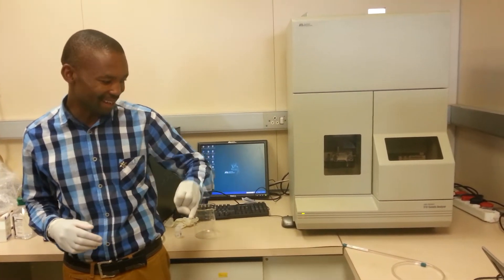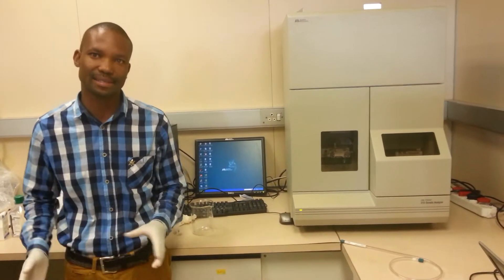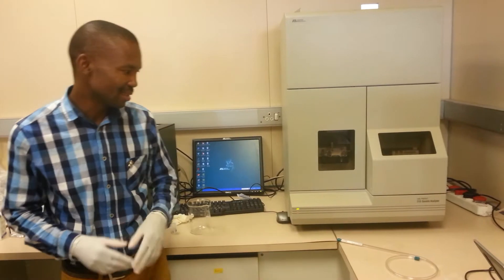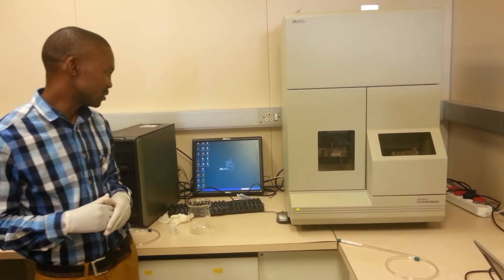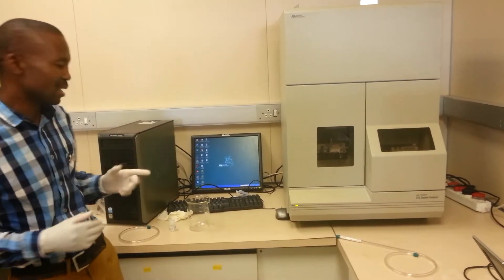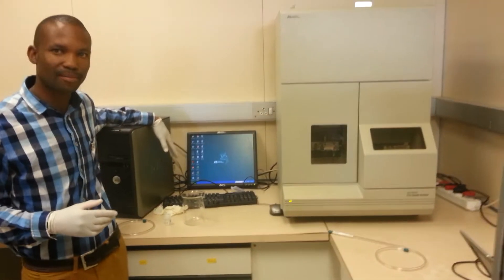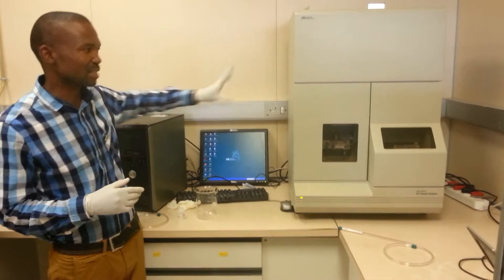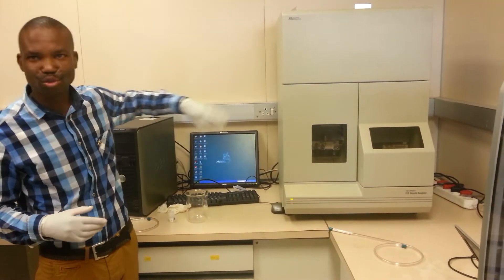From flashing green to solid green indicates that the self-test is completed and everything has passed. So this is good. There's no real sequence in terms of switching on the instrument, because other instruments like our bigger sequencer, you have to start with the PC first, and after the PC is fully on, then you start with the instrument. In this case, you can even switch on the instrument first — it doesn't matter.